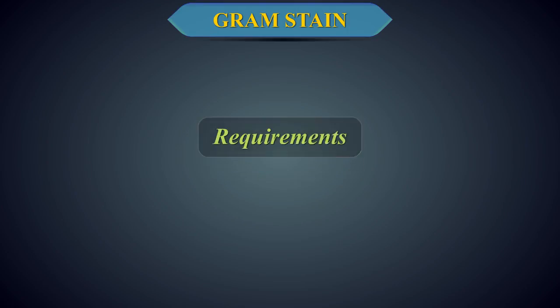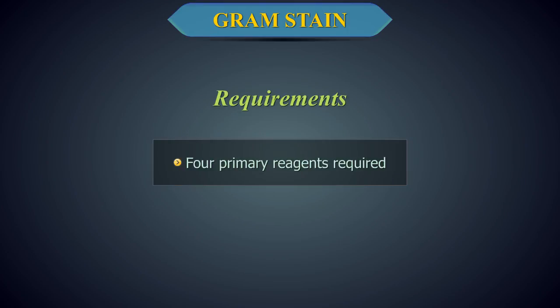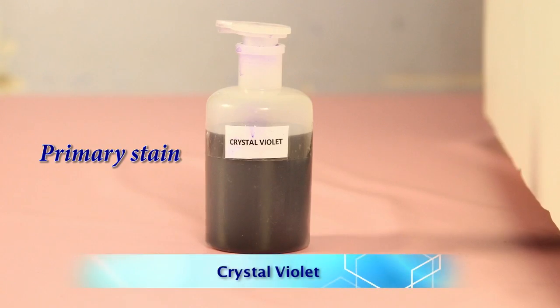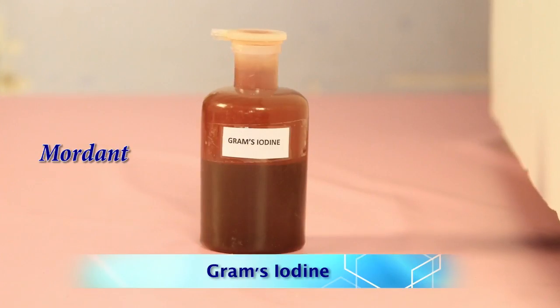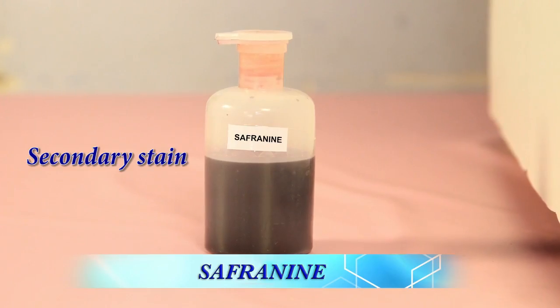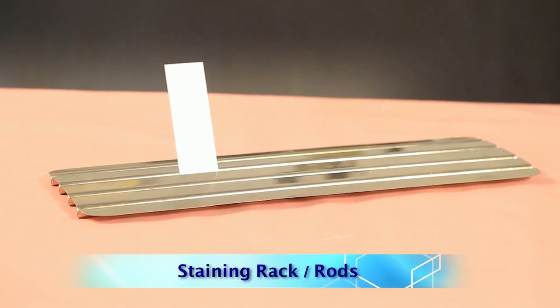Requirements. The four primary reagents required for performing Gram staining are: crystal violet which acts as the primary stain, Gram's iodine which acts as the mordant, 95% ethyl alcohol or acetone which acts as a decolorizer, and safranin which is the secondary stain or the counter stain. Staining rack or rods.